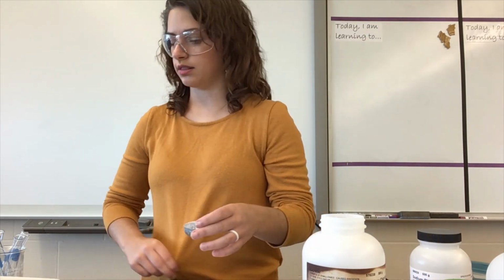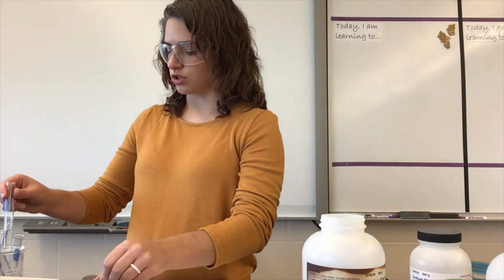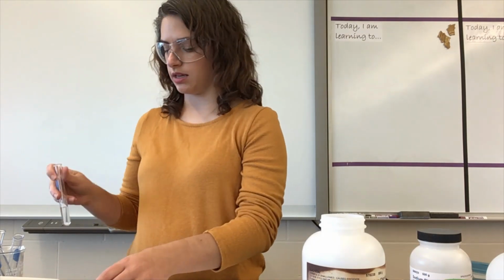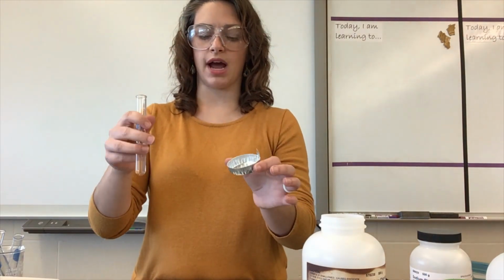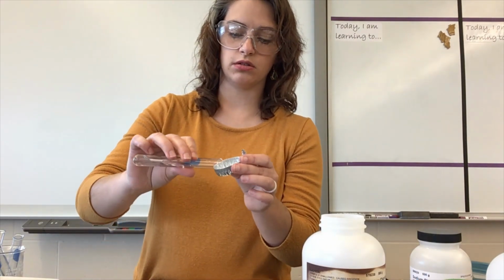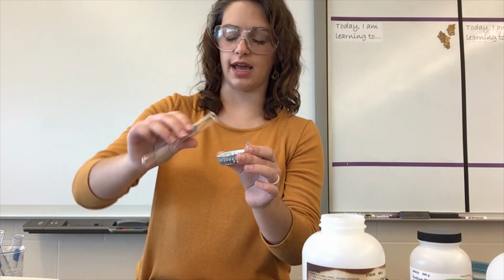Oh, that's lovely, the bell. Okay. For my solution, I can't fit my probe into my test tube, so I am going to go ahead and pour my solution into a different weigh boat. So I kind of end up with a puddle on the end.